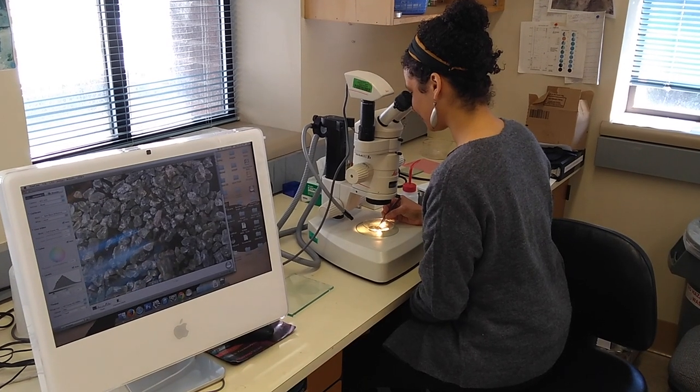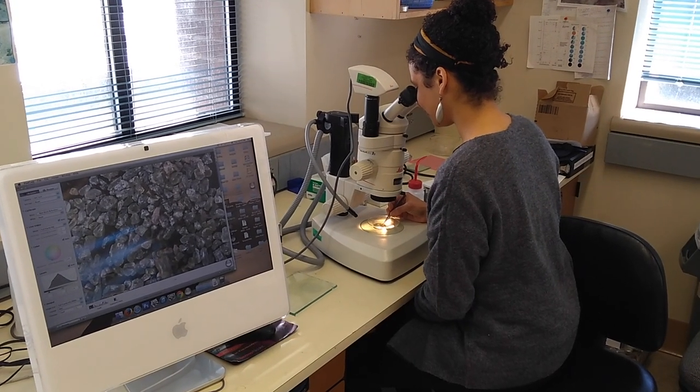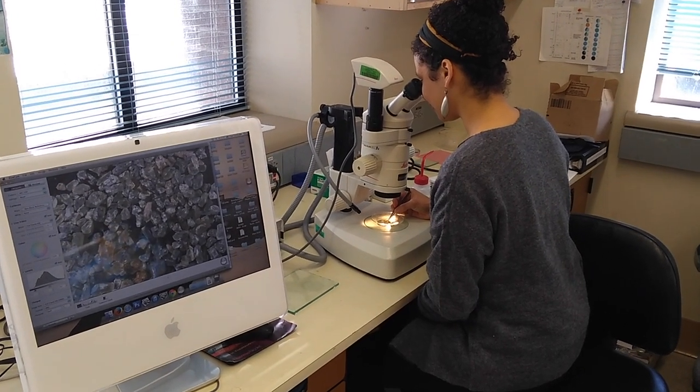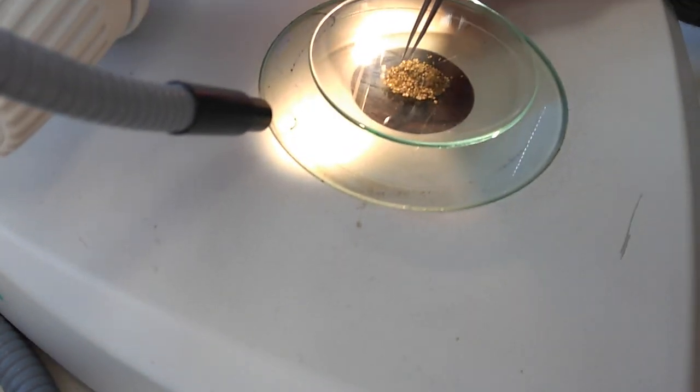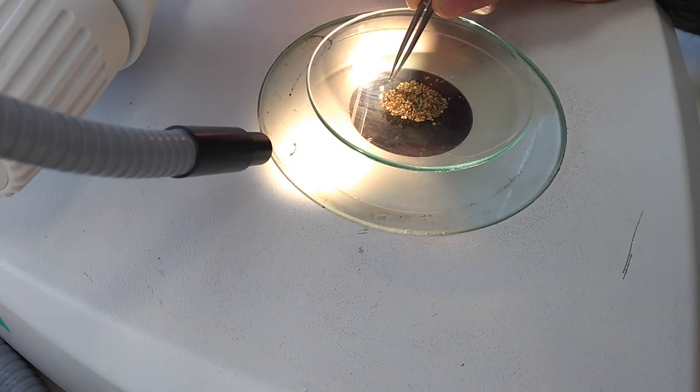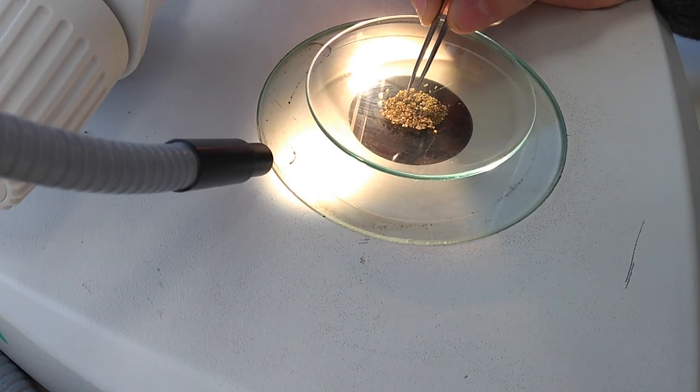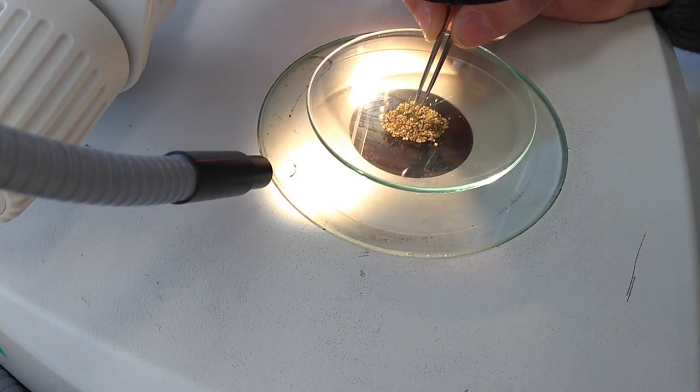The first step is to pick appropriate minerals from the sample. These are olivine crystals where we look for melt inclusions inside.